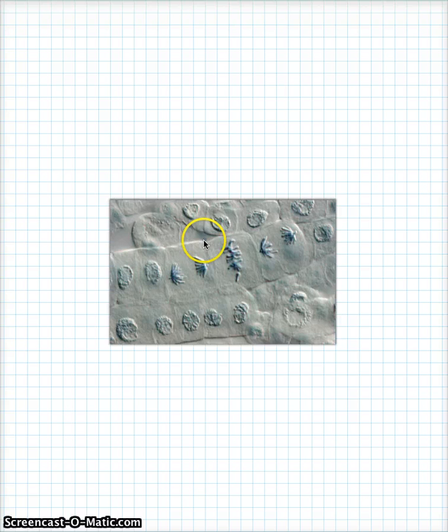All right, keep it going. This one's really cool because this is a more three-dimensional picture. This is a photograph using a different kind of microscope so that we can really see things. You can see the chromosomes better, and now hopefully you can see what a cell in interphase really looks like. Look at this. Just looks like a little fried egg inside the cell wall there.